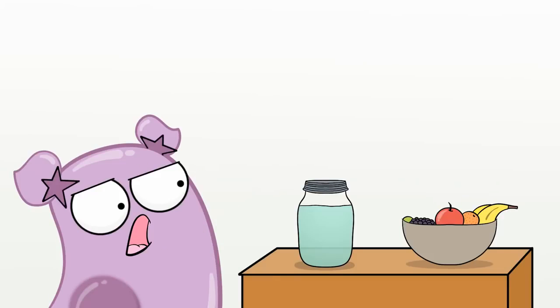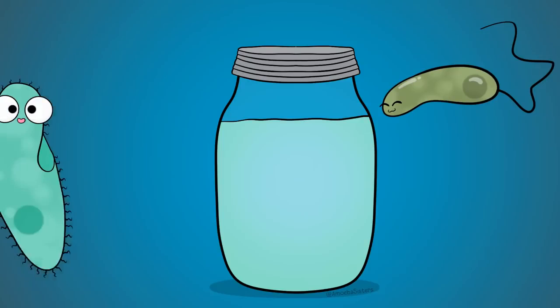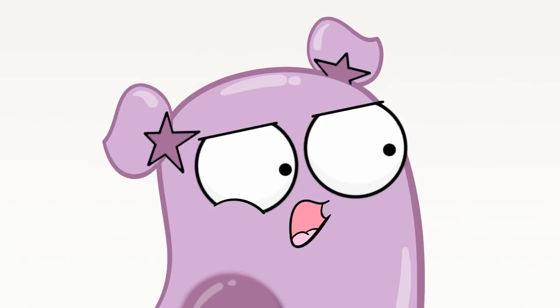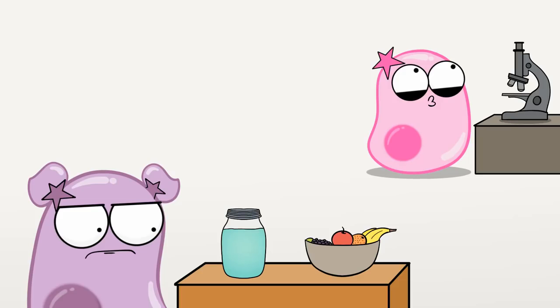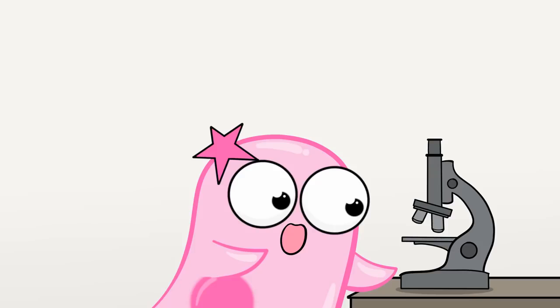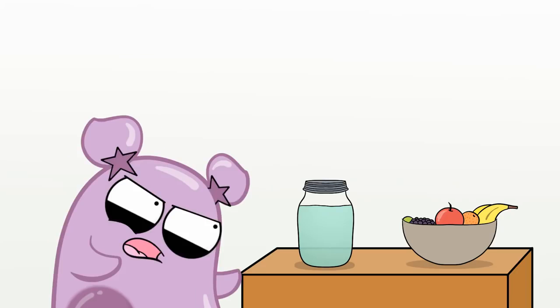Pinky, what is on the kitchen table? Oh, it's my protist. I'm hoping to find some euglena, maybe some paramecia. I took the sample from... Stop. I meant, why is it on the kitchen table? Oh, I got distracted. I was going to take some drops and put it on a slide while I set up my microscope. Yes. Well, please get your green water away from where we eat.